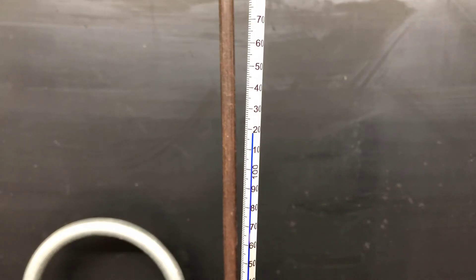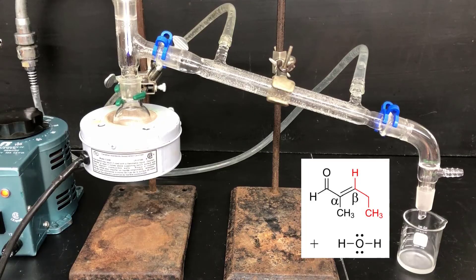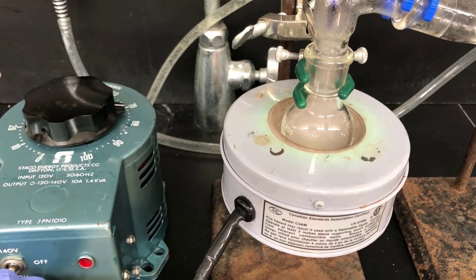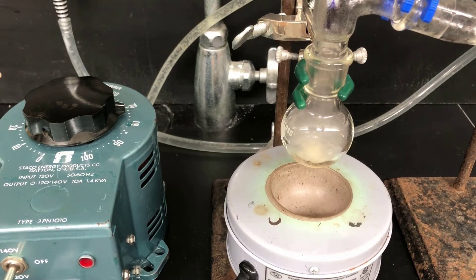If the vapor temperature climbs much higher than 140 degrees, there's a chance that the aldol product might be distilling instead of the dehydrated aldol product. What's collecting in the vessel on the right is the dehydrated aldol product in water, and there could also be a little propanal starting material left over. Keep the distillation going as long as the vapor is below 140 degrees, but you'll need to stop before you distill to dryness. When the flask has very little liquid left, turn off the variable transformer and lower the heating mantle.